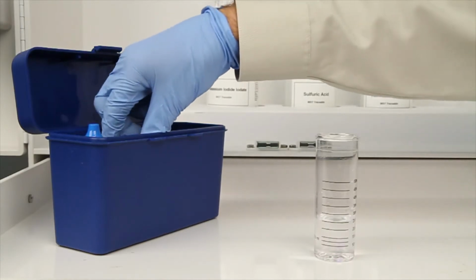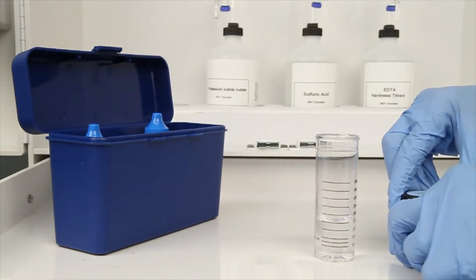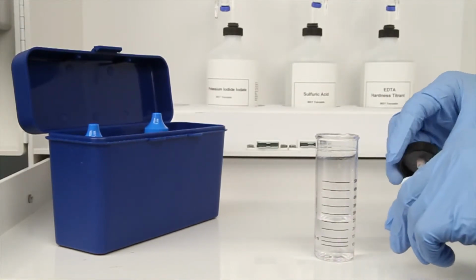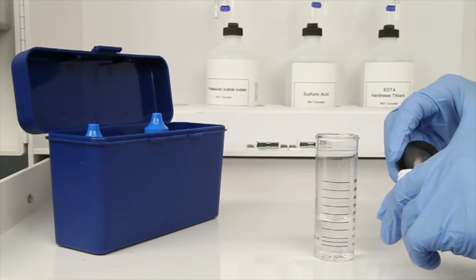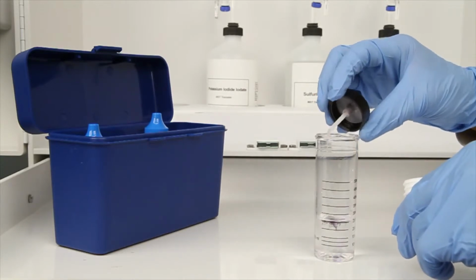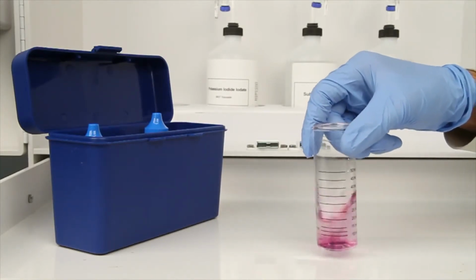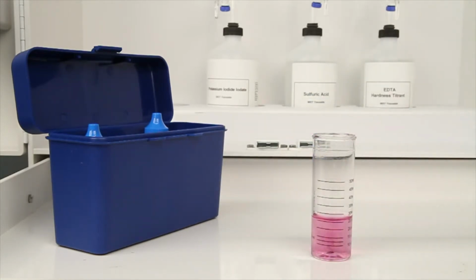The next step according to the endpoint ID procedure is to add 1 scoop of calcium hardness indicator powder. After the addition of the powder, swirl the vial to make sure the powder is completely dissolved. In this case, the sample has turned red, indicating that hardness is present. If the sample had turned blue, then no hardness is present and the titration is complete.